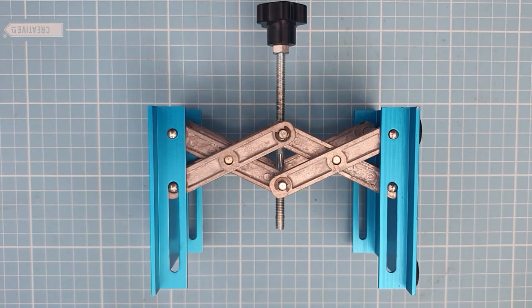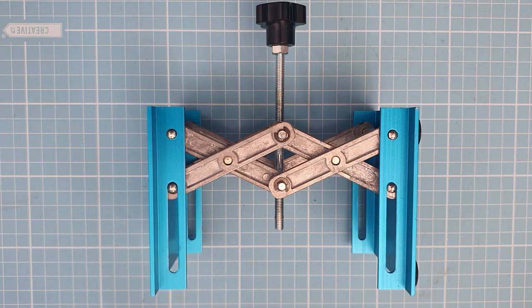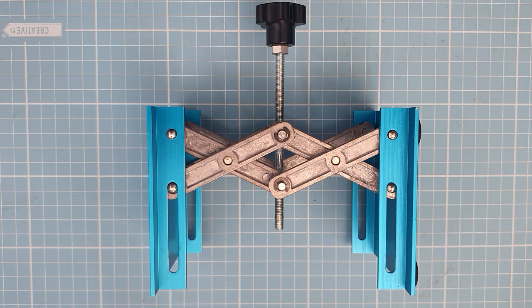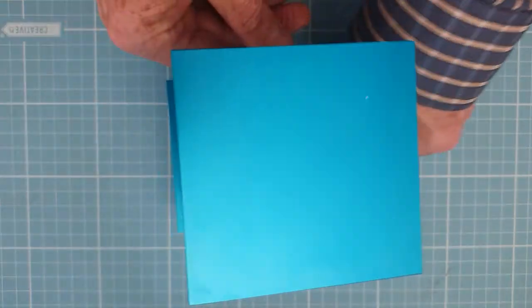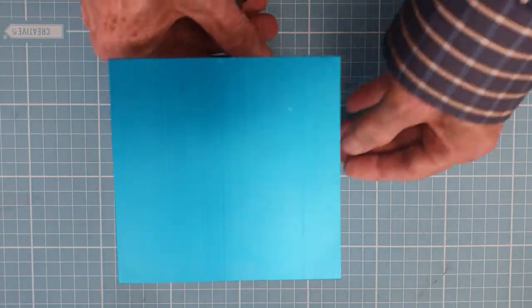This is a laboratory scissor jack I got from AliExpress, delivered to Australia for about 27 Australian dollars. Its dimensions range from 4 centimeters to 16 centimeters tall, and the platform is 10 by 10 centimeters.